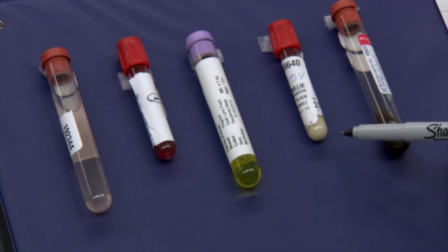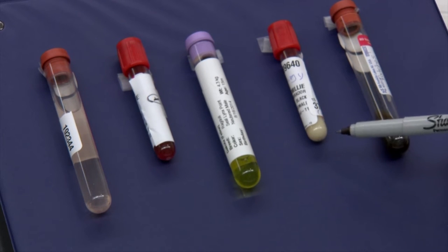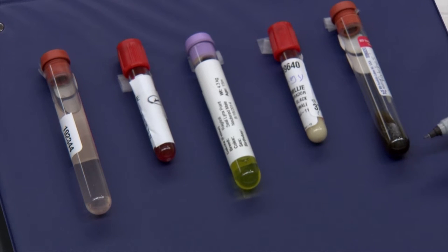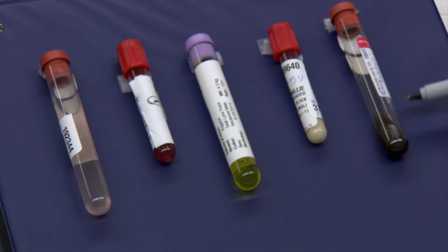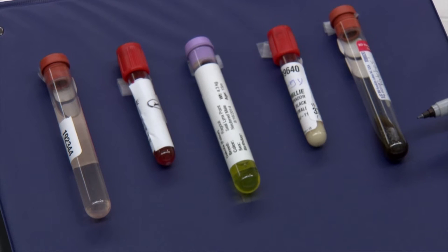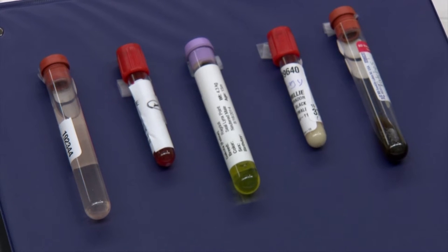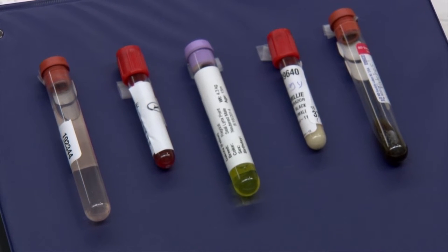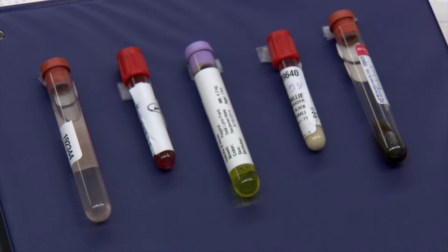This one appears to be opaque or turbid and lipemic. We do get that. And this one appears to be green and cloudy and that is potentially a bile sample. But they run the gamut. If you have joint fluids we also describe whether they are viscous or not. And we also describe whether there is any fibrin, clots, flocculent material present.